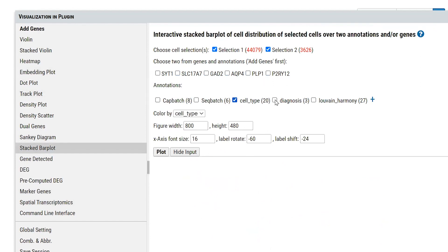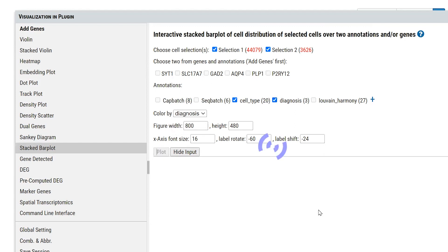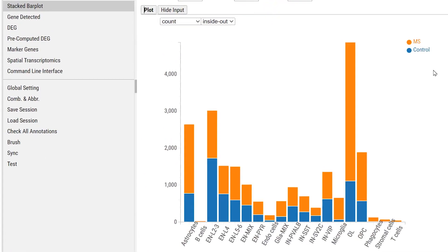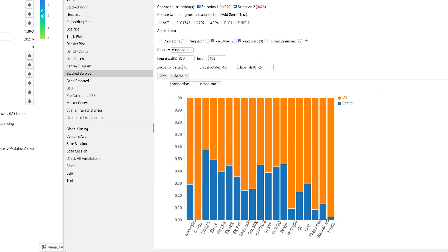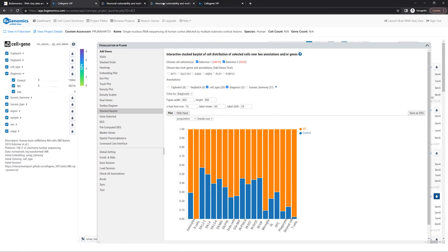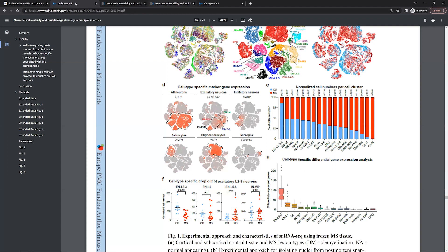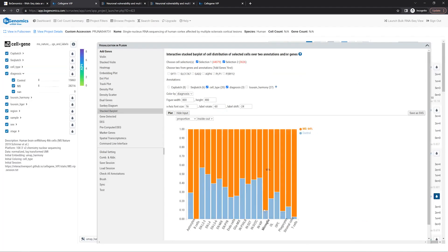Choose Cell Type and Diagnosis, and Color by Diagnosis. The default plot shows the count. We can change it to the proportion, and now this plot matches Figure 1E pretty well. We can see a high proportion of microglia cells are from MS patients.